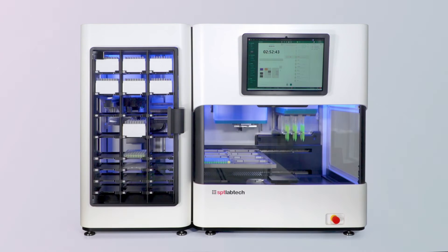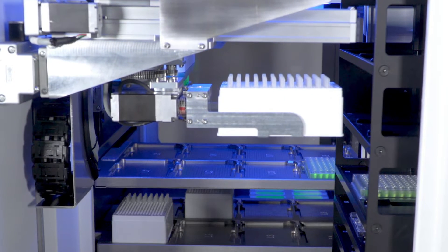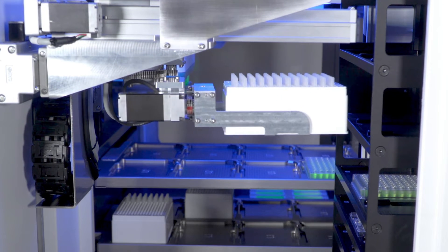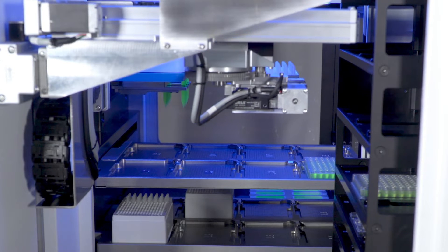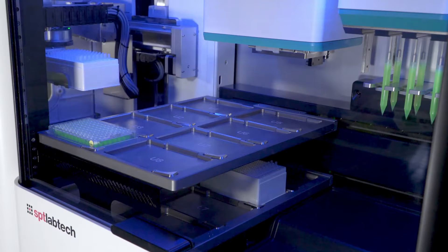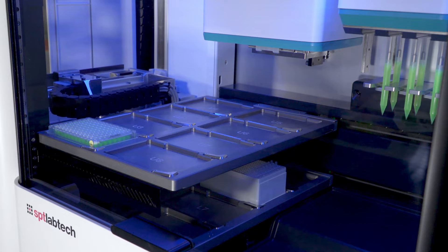At the start of the protocol, you can see the gripper from the expansion module coming in and collecting a tip box from one of the shelves. This tip box will be moved into the lower deck of the Firefly unit. You can see the gripper moving into position, going down and placing the tip box into one of the deck positions on the lower deck.